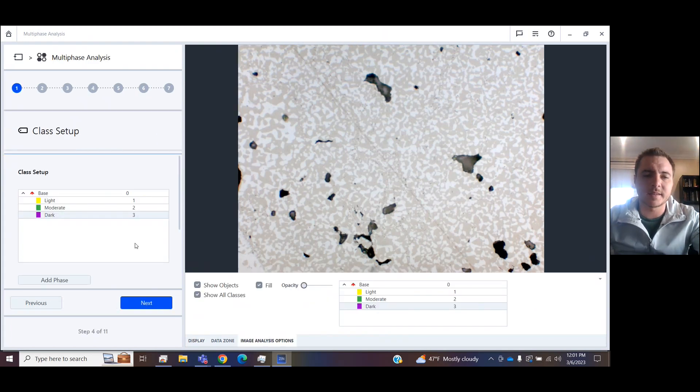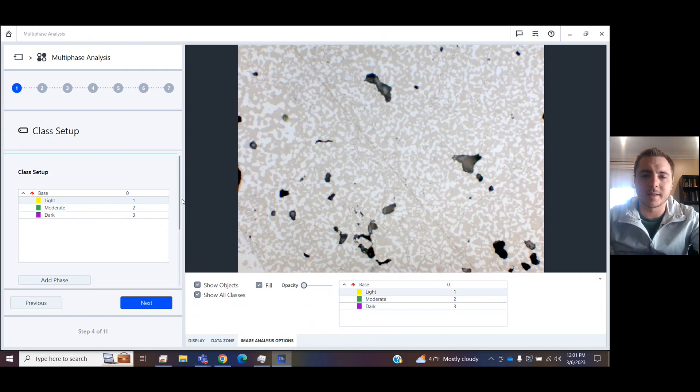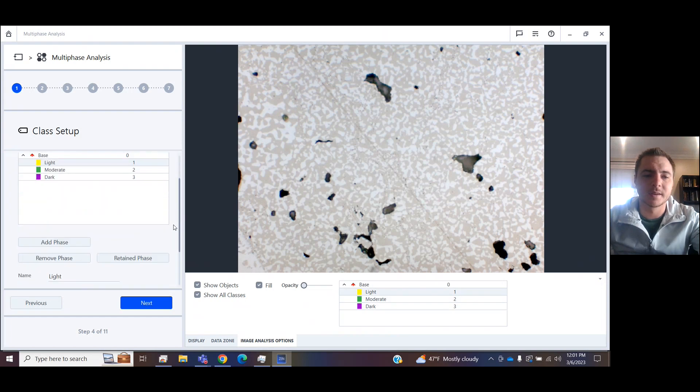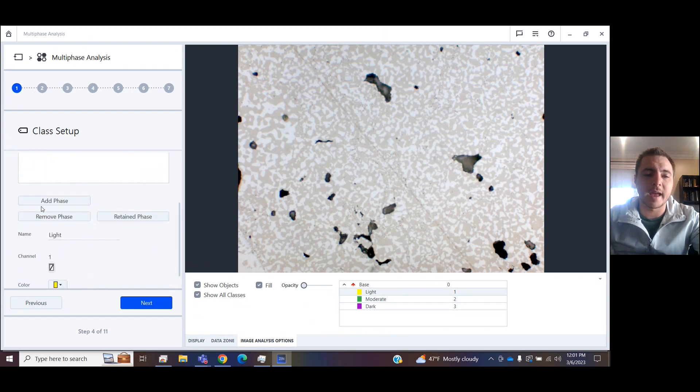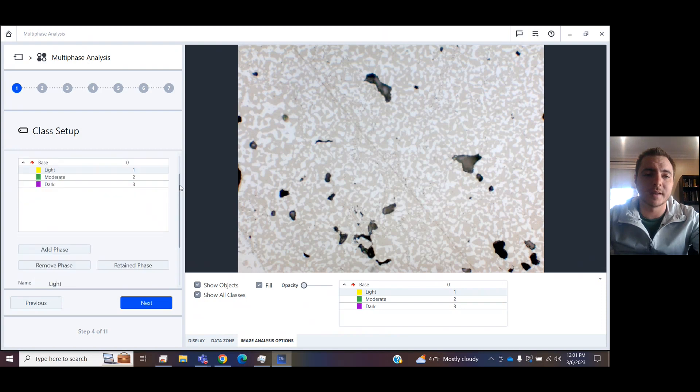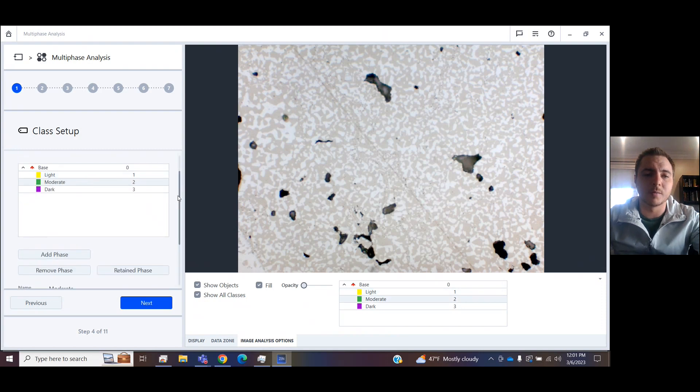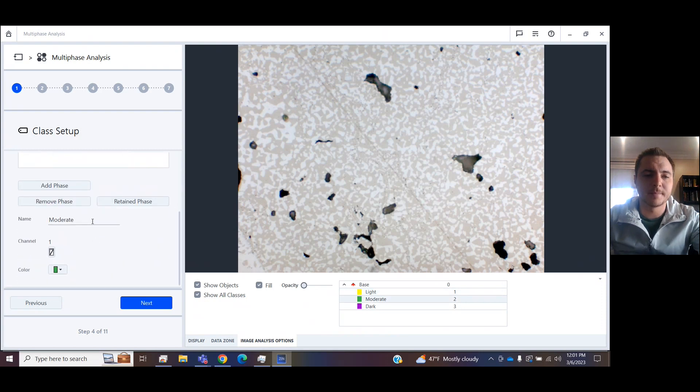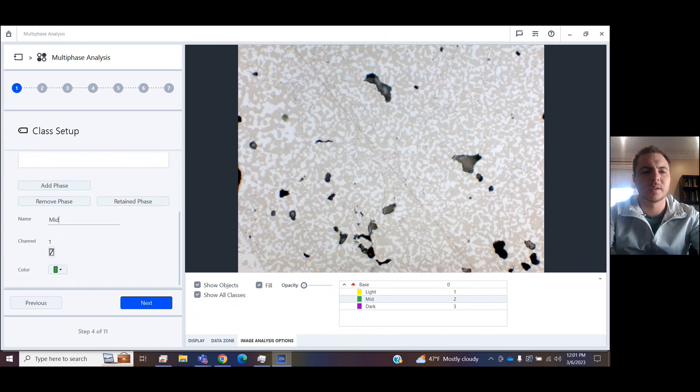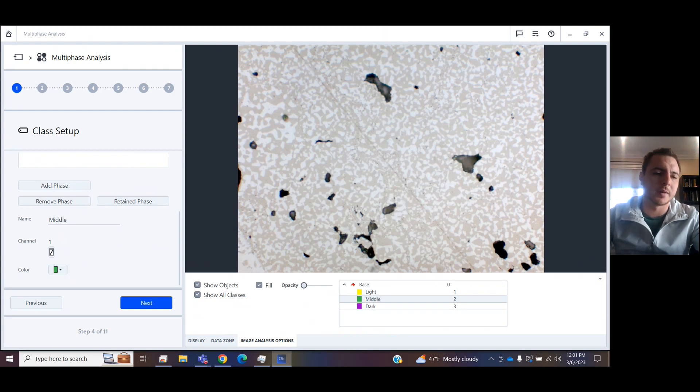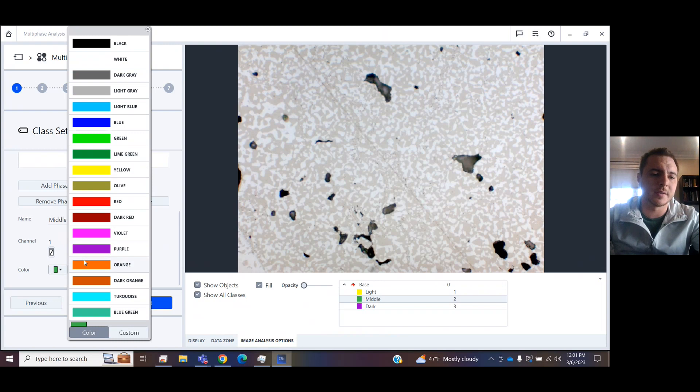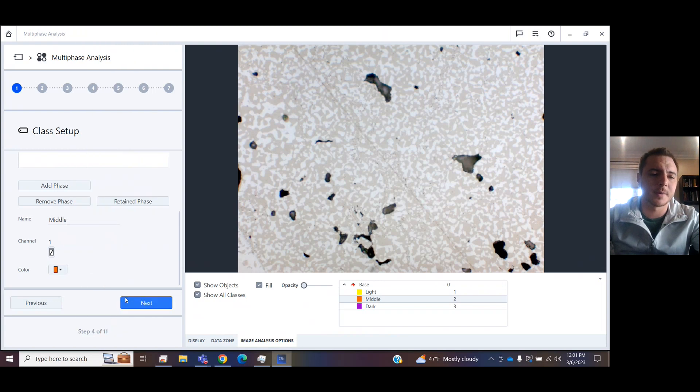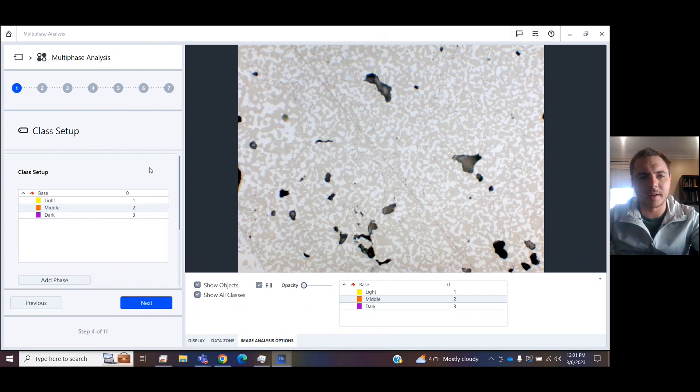In the next step, you can set up different classes. So you could add as many as 32 phases on here. You can rename them. In this particular example, I see three, so we're going to do three, and you can change the color. So this is where we just tell it all the different phase classes.